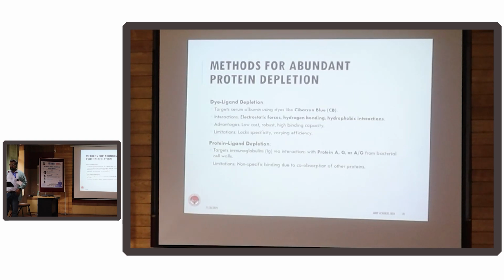And when you induce variation, you stop seeing the biology. You start seeing artifacts. You have induced variations in your own sample prep. What you're seeing as differentially expressed proteins, the DEPs, and now you're making heat maps, you're making models and telling this is my panel, what your panel is showing is the difference that you got while processing the samples over the past 6 months.